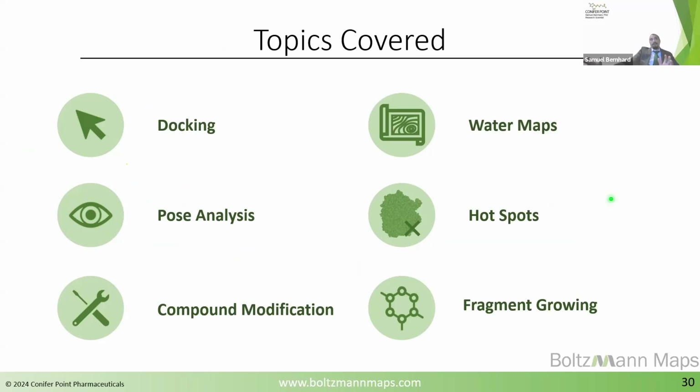Today was an example project explored in BMaps that employed docking, fragment-based analysis, as well as water simulations, and showed hotspot analysis. All of this together highlights BMaps as a powerful tool to develop new compounds with ideal properties.